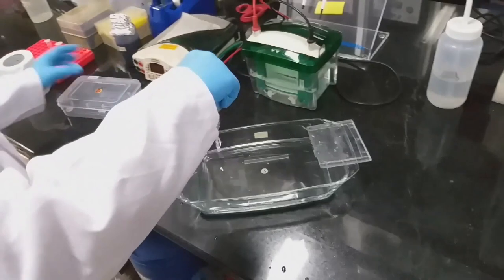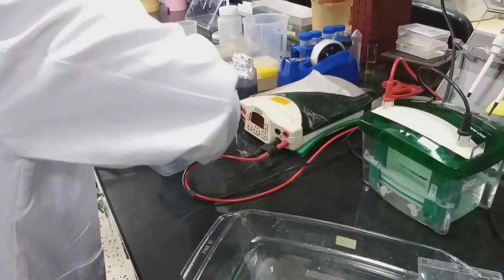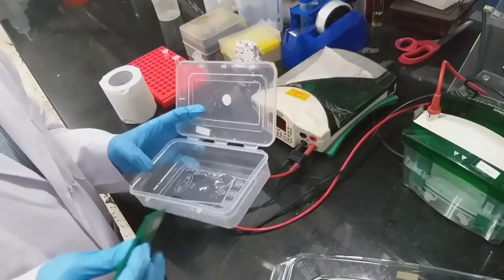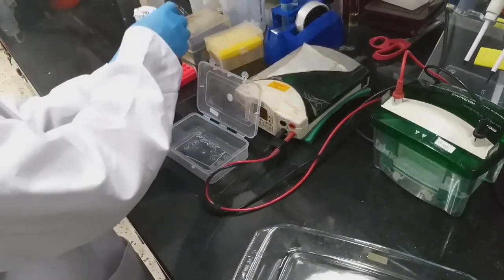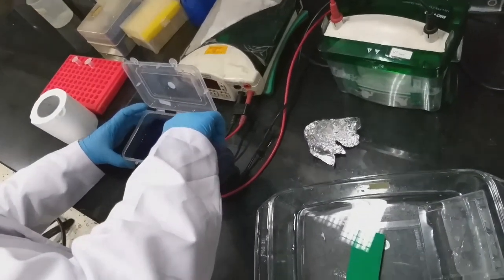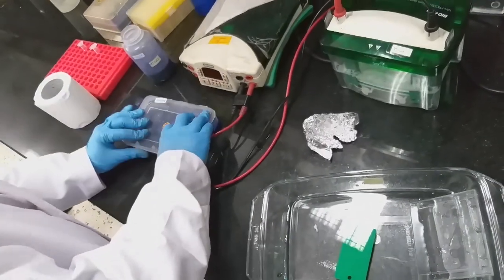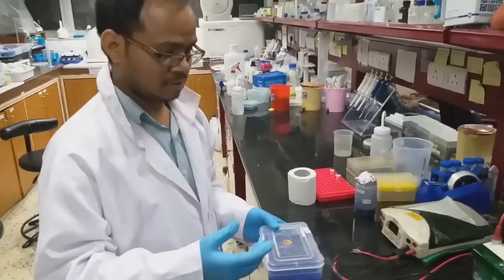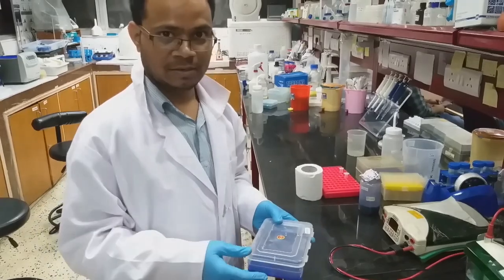We'll keep the gel in a staining box, which is more or less a plastic one, but it can sustain the. So then I'm going to add staining solution. I will keep it for a rotation on a shaker for at least 2 hours, then we will de-stain.